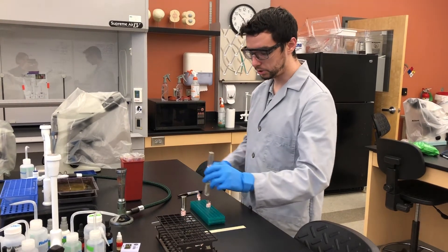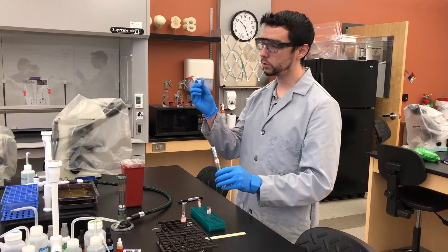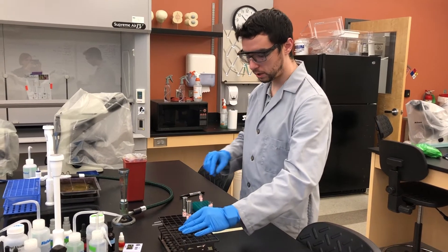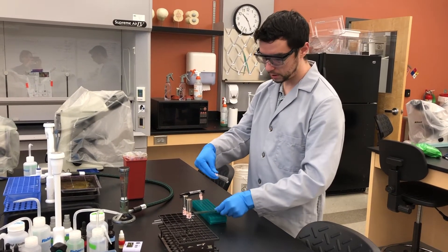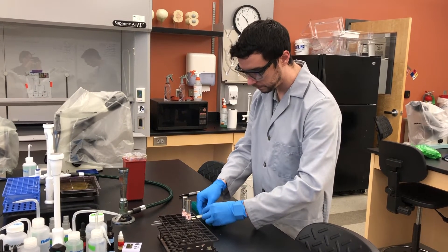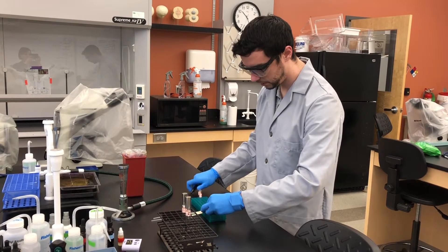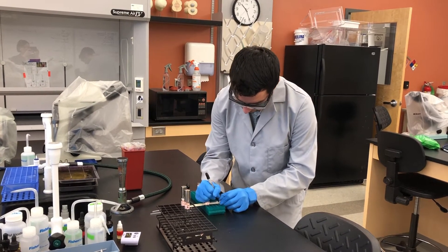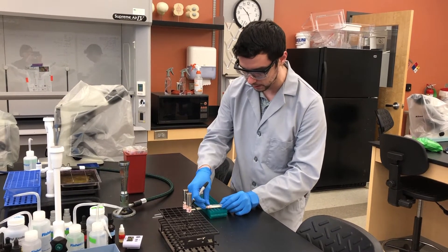Here is my EA culture, already grown for 48 hours, so we are simply transferring some of that volume over. You are going to take these tubes and measure roughly one centimeter from the bottom, mark the tube, and fill it with culture up to that line.